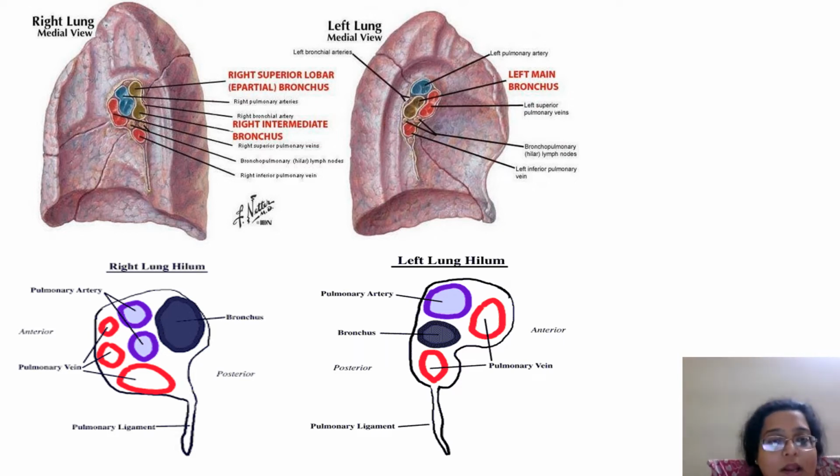Okay, so here what you see is a pulmonary artery, again blue. Okay, and then this is the pulmonary vein. Okay, and then there are other structures. See now, this over here is a bronchial artery, not visible, but this artery is red actually. Okay, and this is a bronchial artery, but the larger diameter ones, the color has changed, and you will read up and answer why this has happened, and then there will be lymph nodes and pulmonary veins, etc.